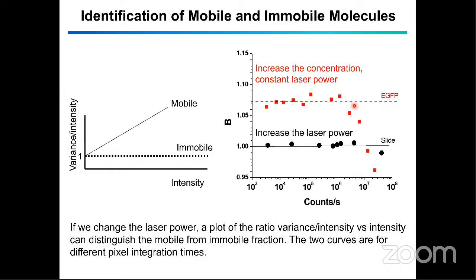If you push more, you see that at some point the brightness drops off. At this point, you see we're in the region of more than 1 million counts per second. So at some point you will start to saturate your detector, get in the nonlinear range. So you have to make sure to avoid this range. For photomultiplier detectors, the maximum count rate you can usually get is maybe 10 million counts per second, but at that point you're already close to saturation, so you should avoid that. Typically, stay below maybe 1 million counts per second or something like that. Again, it depends very much on your detector. If you use an avalanche photodiode detector, these have much lower saturation rates, so there you have to be even more careful. Maybe you can only have a couple of 100,000 counts per second.